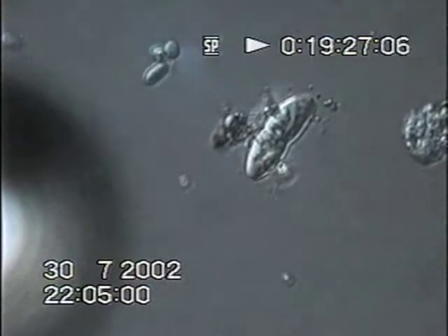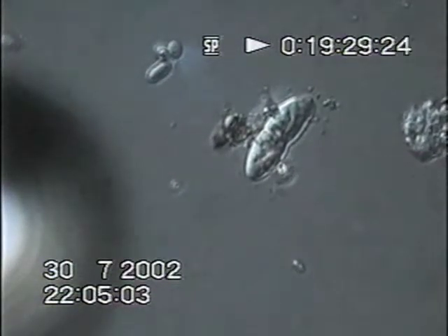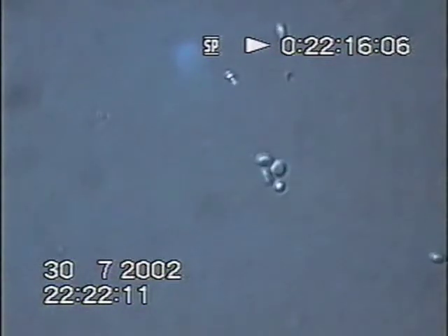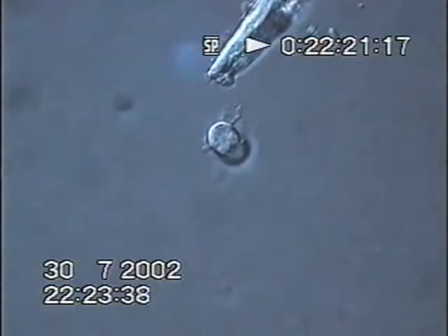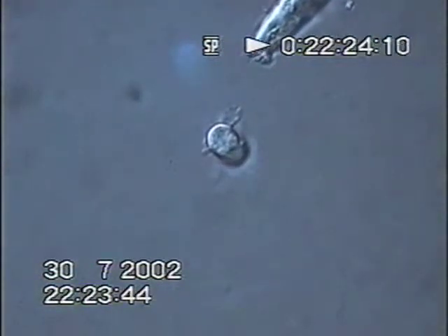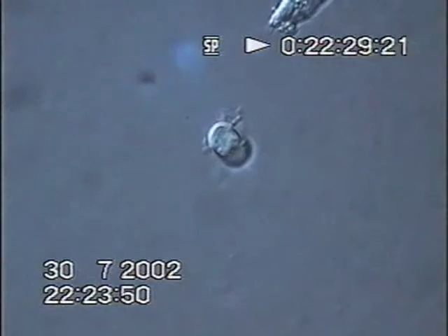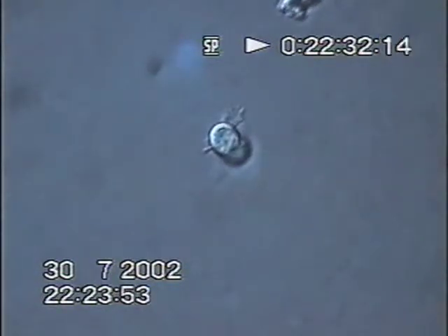This might be a Leptospira, but it hasn't got the central division. Dancing organisms. Which is twinkling away. Here we have some more motile bugs, some going faster than others. Now X40 lens, here we have a spore unidentified with 2 apparent projections from it, which may be some of these other organisms being attached to it.